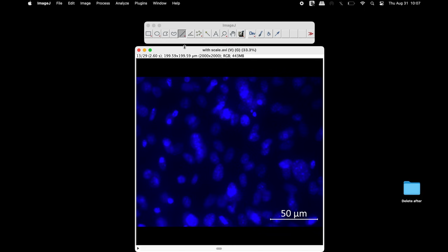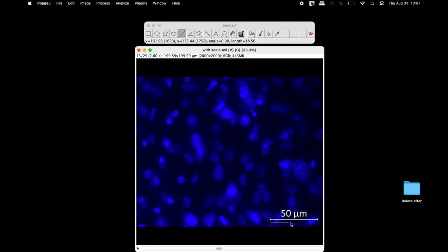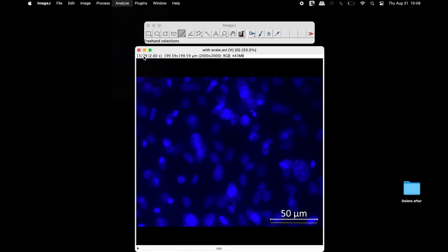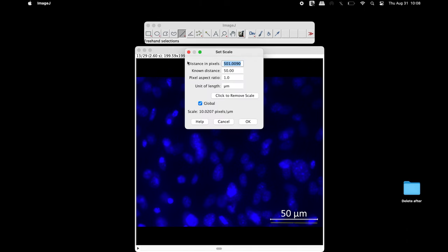If there is a scale bar in the image, the scale can be set. On the other hand, in the absence of a scale bar, the area can also be measured in pixel units.